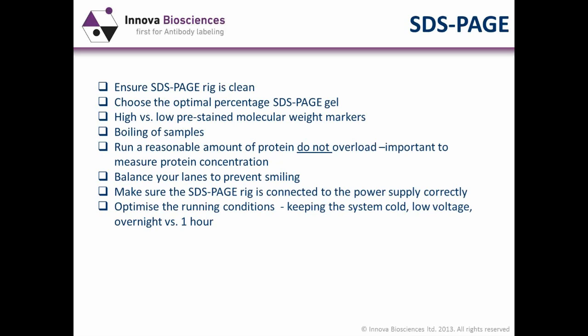Again, just make sure you connect the positive to the correct connection point. And as I said earlier, depending on the situations that you use, you need to optimize the running conditions.